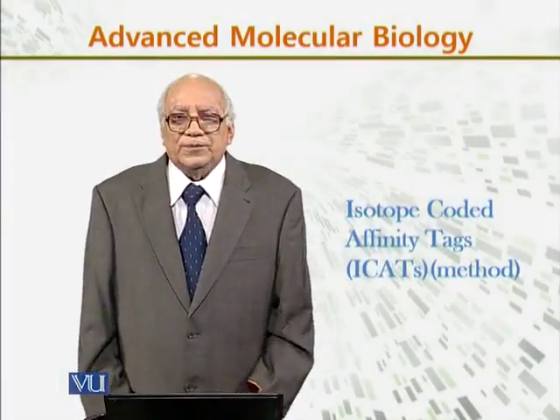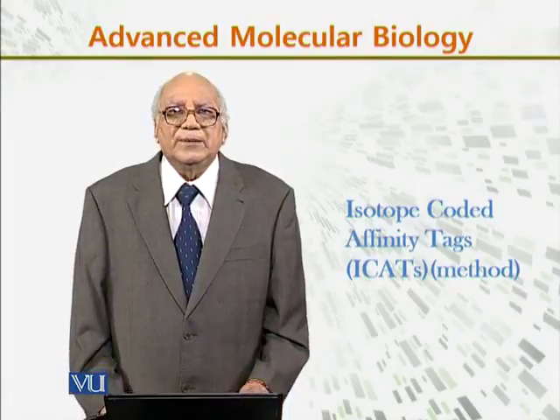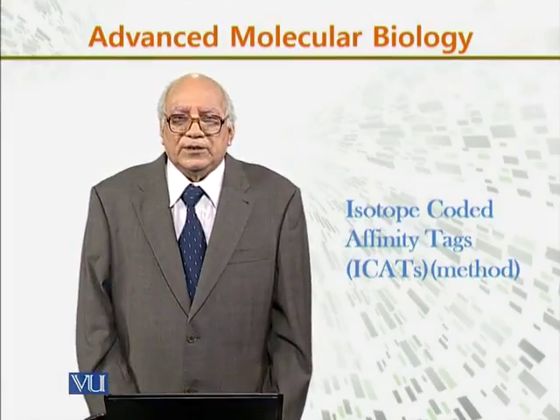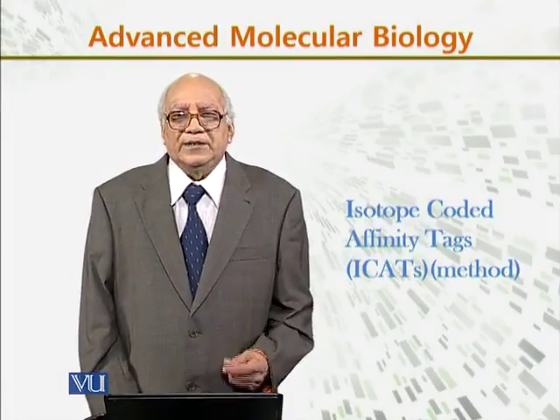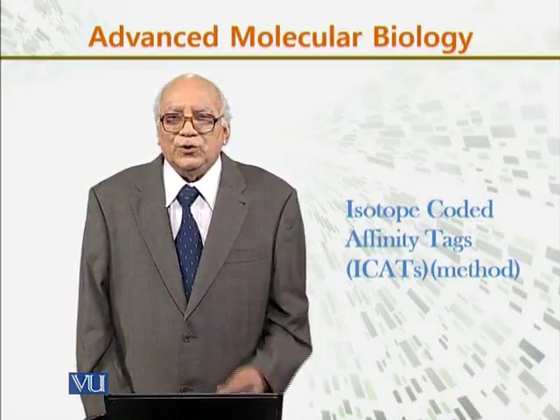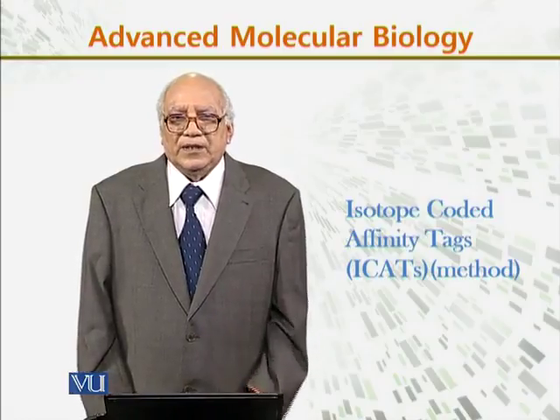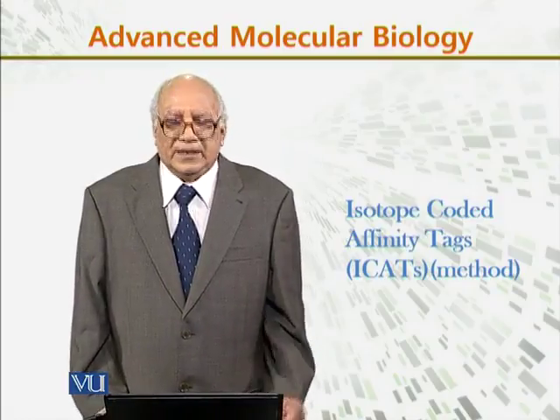In this module, we will discuss another important method to quantify proteins. The method is isotope coded affinity tags, ICATs.